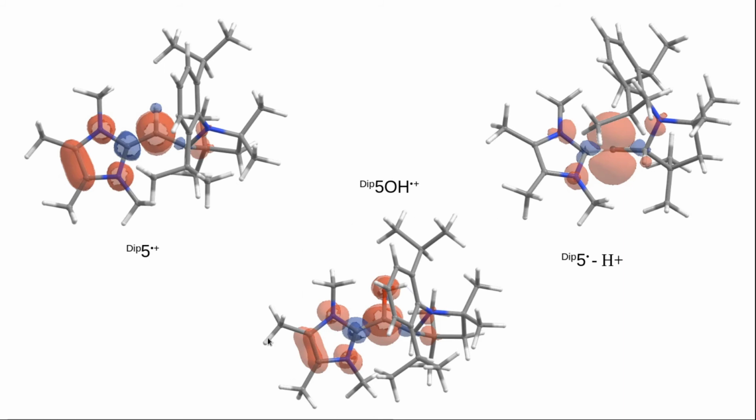So I'm not saying that this is exactly the radical that we observed, but definitely whatever radical we observed had to have one extra, at least, atom near the radical region, because the spin density was overall too high in all atoms, and all hyperfine splittings were considerably higher than experiments. So basically, more atoms were needed to delocalize that spin density and reduce the hyperfine values.